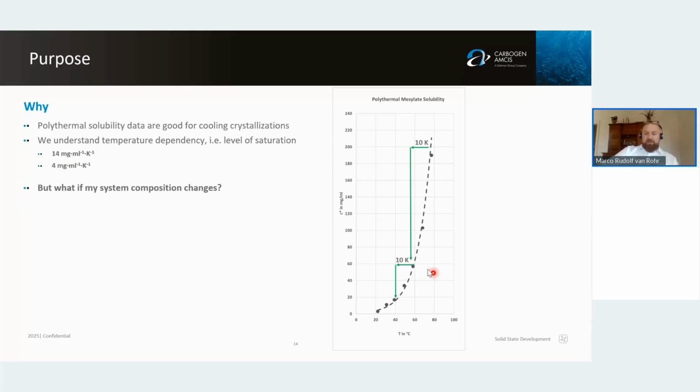If I do the same thing at 60 degrees Celsius to 40 or to 50, something like that, I only get back, yeah, that is more than 10 Kelvin, my apologies. But as you can see graphically, it's dramatically less.